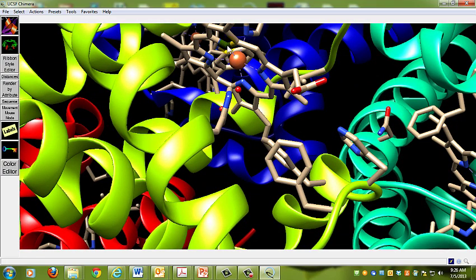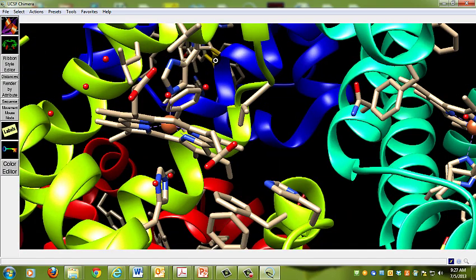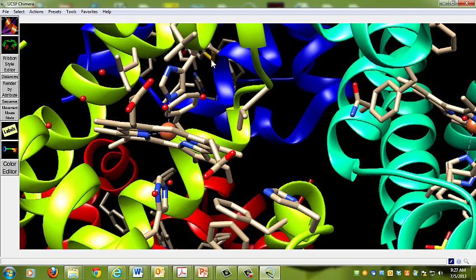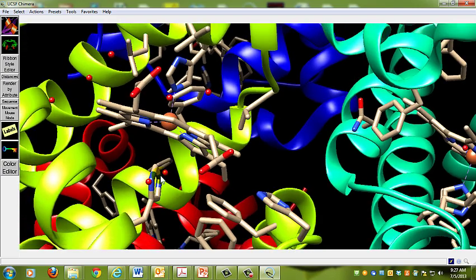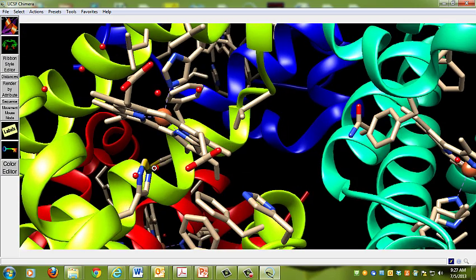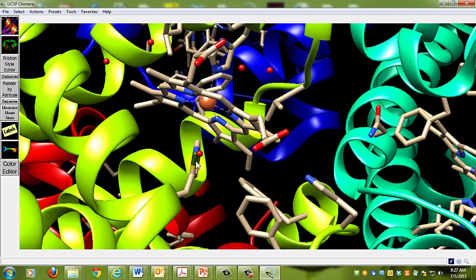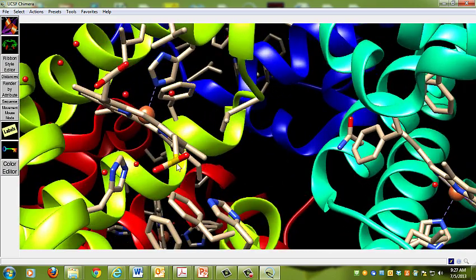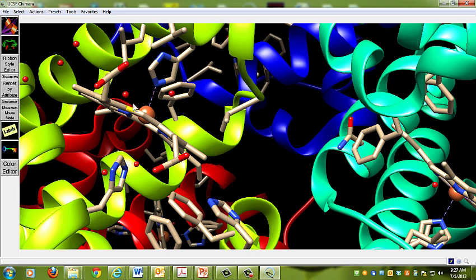There are four nitrogens in the porphyrin nine ring that will also coordinate with that iron. They interact with it in a very nice way to hold it in place. That other histidine is the fifth coordination site. Oxygen binds in this space here, in this nice open cavity. This is the distal histidine down here at the bottom. That distal histidine is very important because it helps protect us from carbon monoxide poisoning and helps bind oxygen just a little bit better. Here are two carboxyl groups on the heme sticking to the outside.